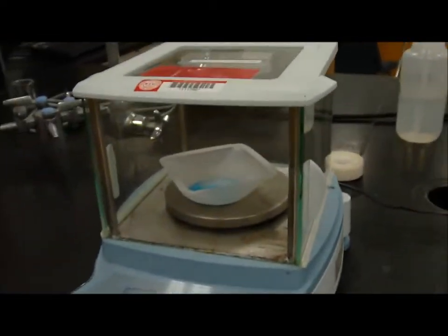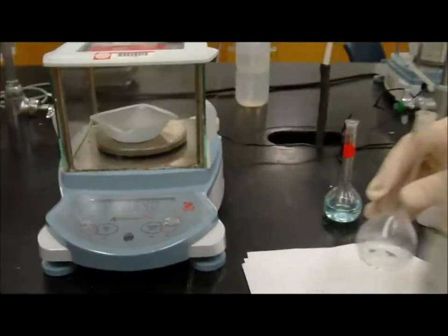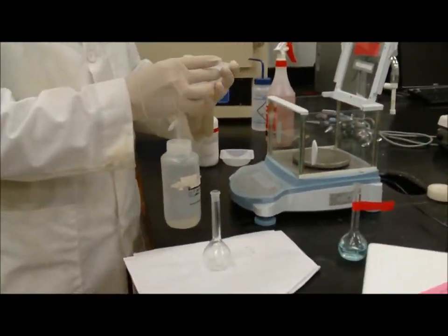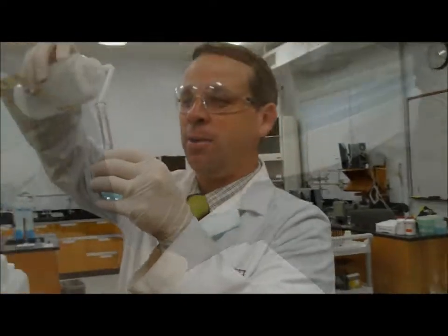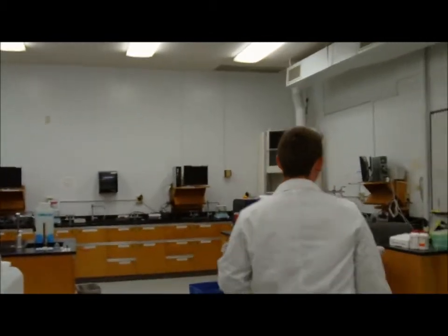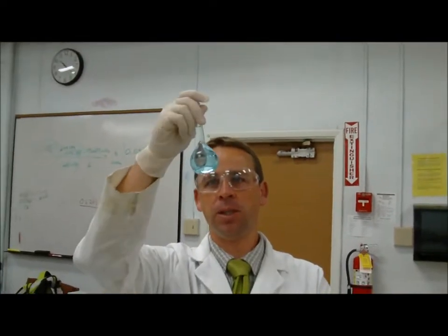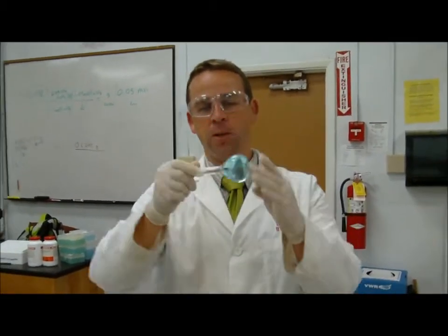All right, now I'm going to deliver it into my 50 milliliter volumetric flask. Whoops, almost lost it. All right. So I fill it up to the meniscus. There we go. Now, I want to make sure that everything is dissolved completely. While this is dissolving, I will get my pipettes ready.